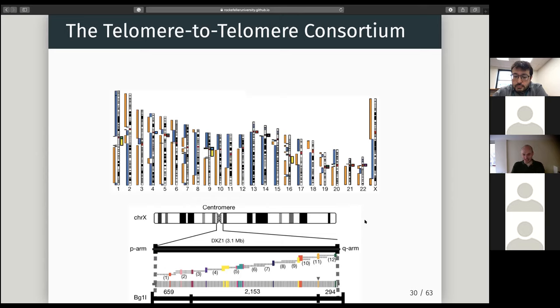And actually the one below here is how they completed chromosome X. Because chromosome X was missing the centromeric repeat. And this was done with nanopore instead of PacBio. That's why Olivier said they keep competing with each other. No, it's before the advent of HiFi, the same consortium using nanopore reads at very high depth, where if you start to sequence very, very deep, you will start to have enough of these ultra long reads that we were mentioning before, that you can span, not necessarily the entire centromeric repeat, but enough so that you can actually walk through the centromere.